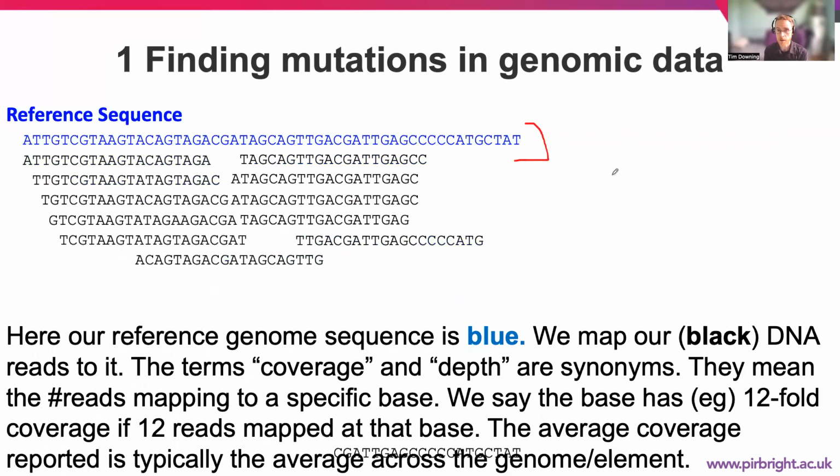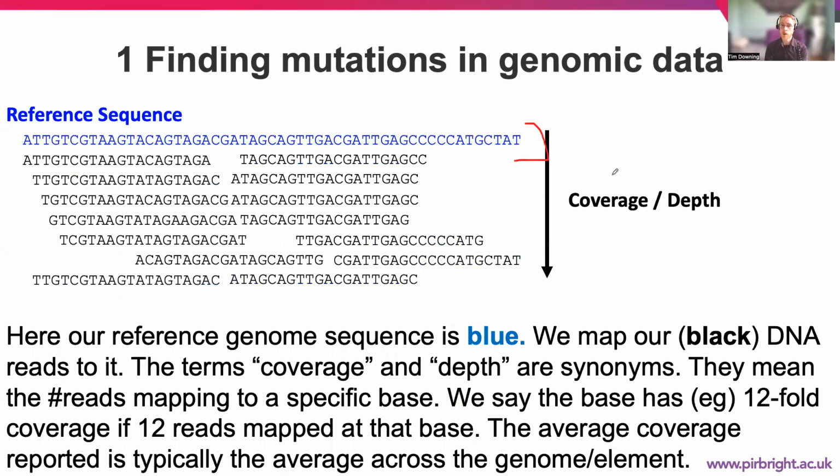Using the consensus calls across the different reads, we can then look at a particular site and see if there are particular bases that are different to the reference. So see here, we have C and we have C all the way through. So there's no evidence of a difference, nor is there any evidence for these particular reads here. Nonetheless, we can look across a single site and say, okay, at this C I've partially highlighted here, is there evidence of any differences?